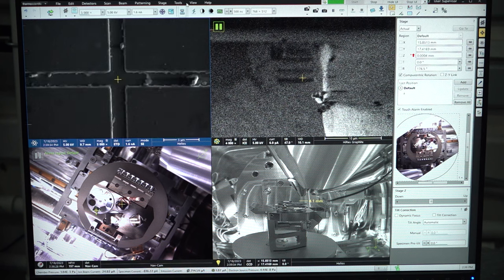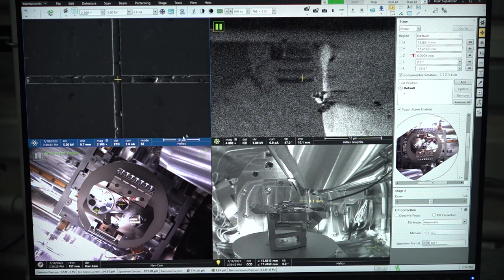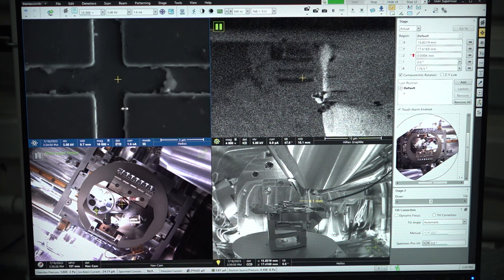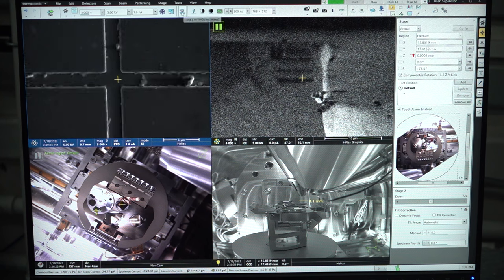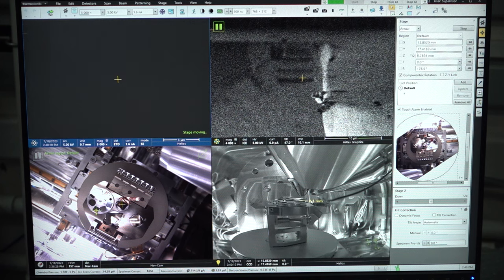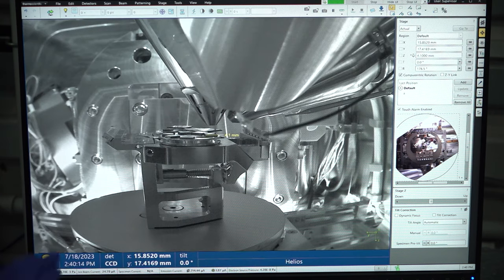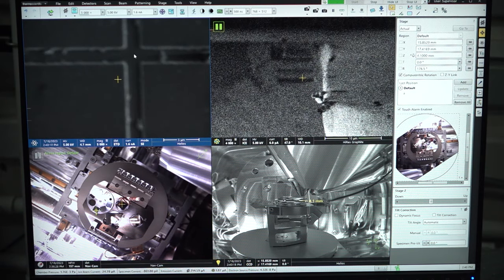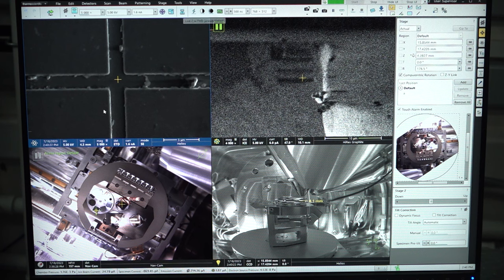Once the image is focused, we can use the SEM for imaging purposes. There is a concept called eucentric height — that is, defining your sample height to the working distance of the microscope. After proper focus at very high magnifications, we need to link the sample height. This is the option: link sample Z to the working distance. Click on this and change the Z value to 4.1. The value 4.1 is the eucentric point, also called the coincident point, where your electron and ion beam images meet.